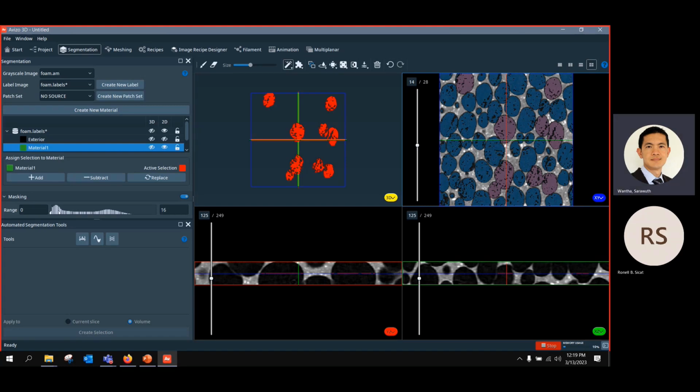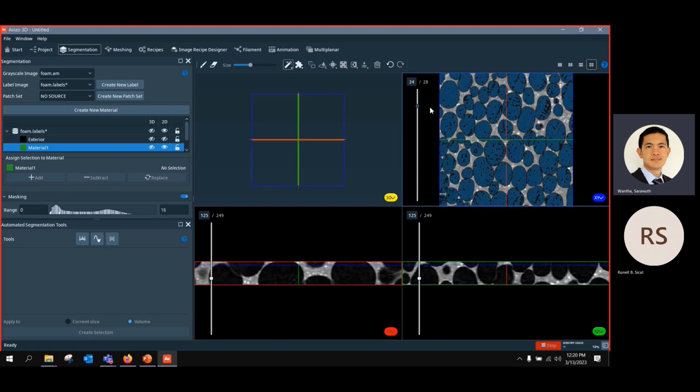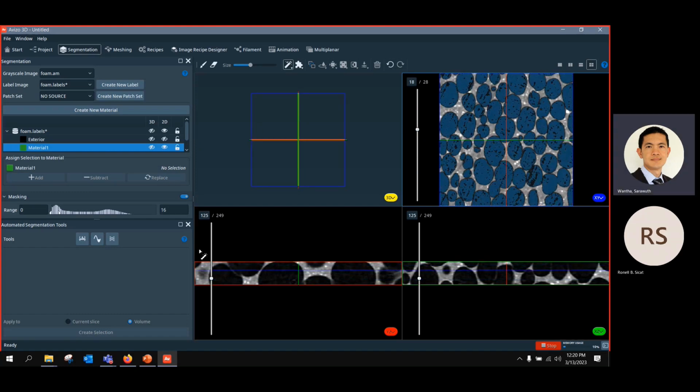Okay. And next one, this is also completely new. Okay, before I go to this, let's go through this list that I mentioned before. We also have, for example, interpolate. To do interpolate, I just do it like this. Clear selection, and maybe you browse between different slices. I can just use it quickly.